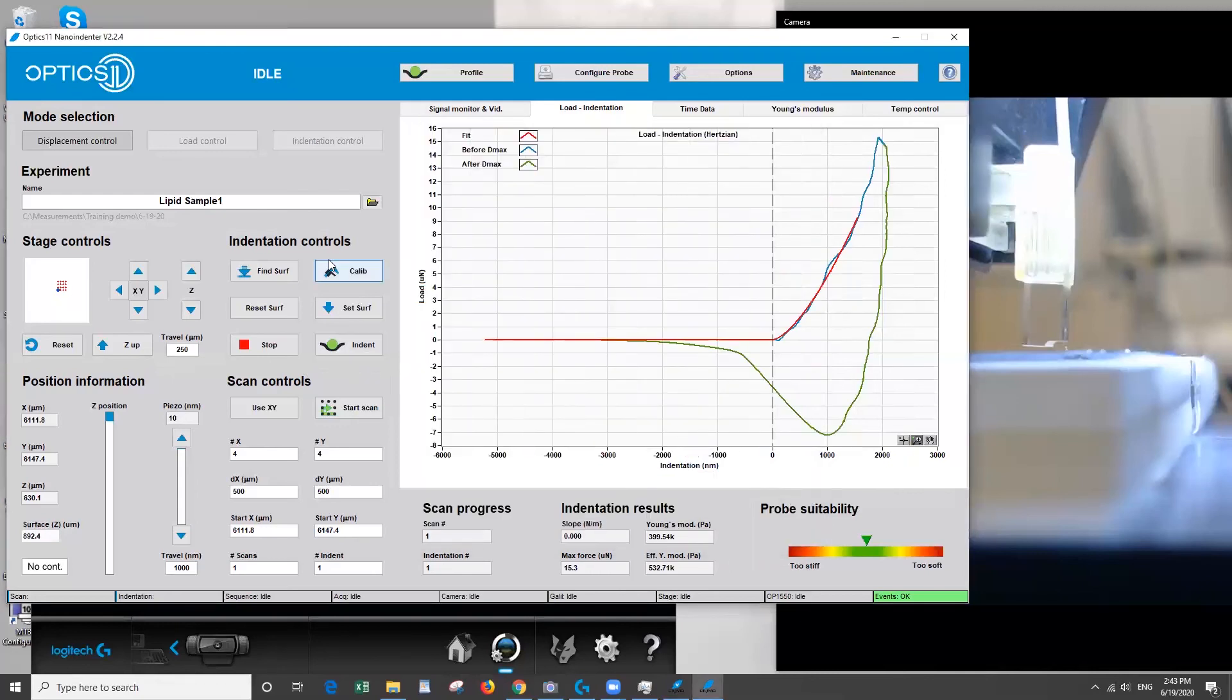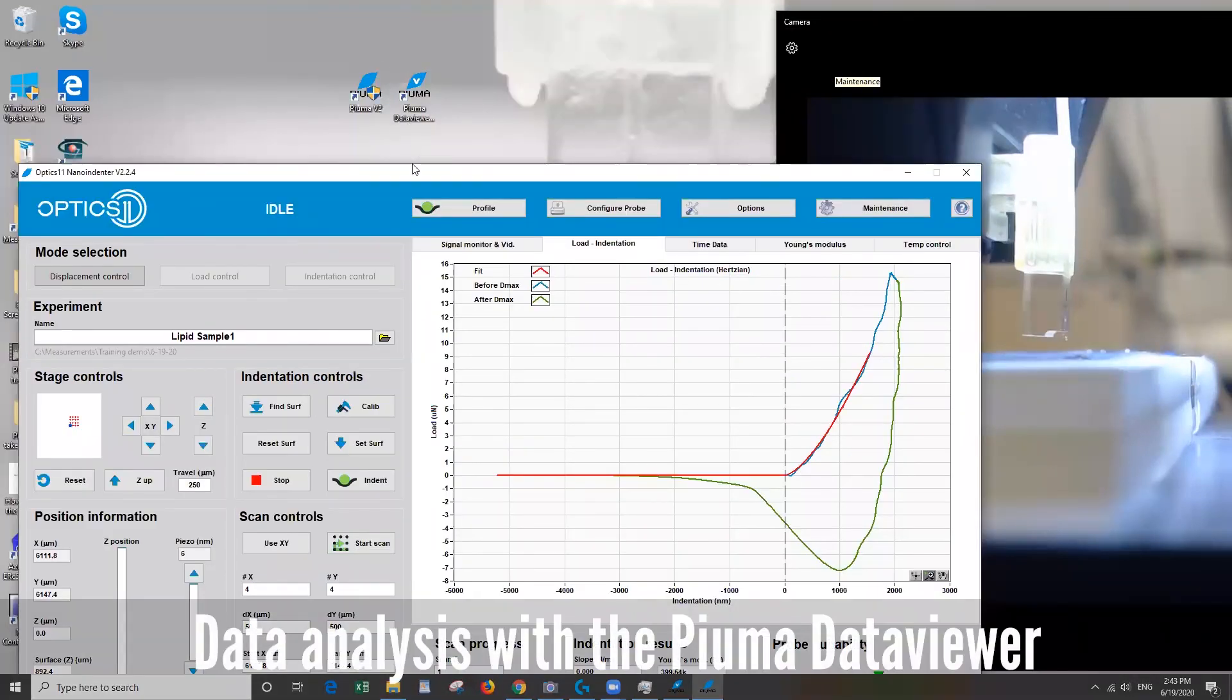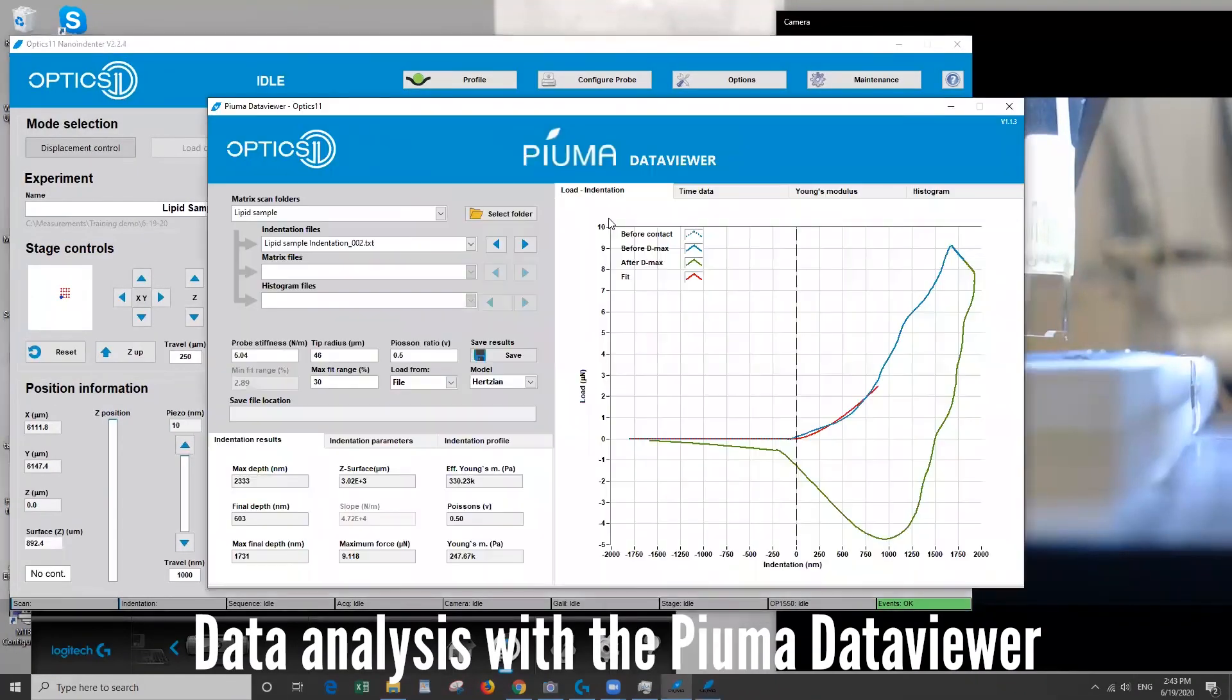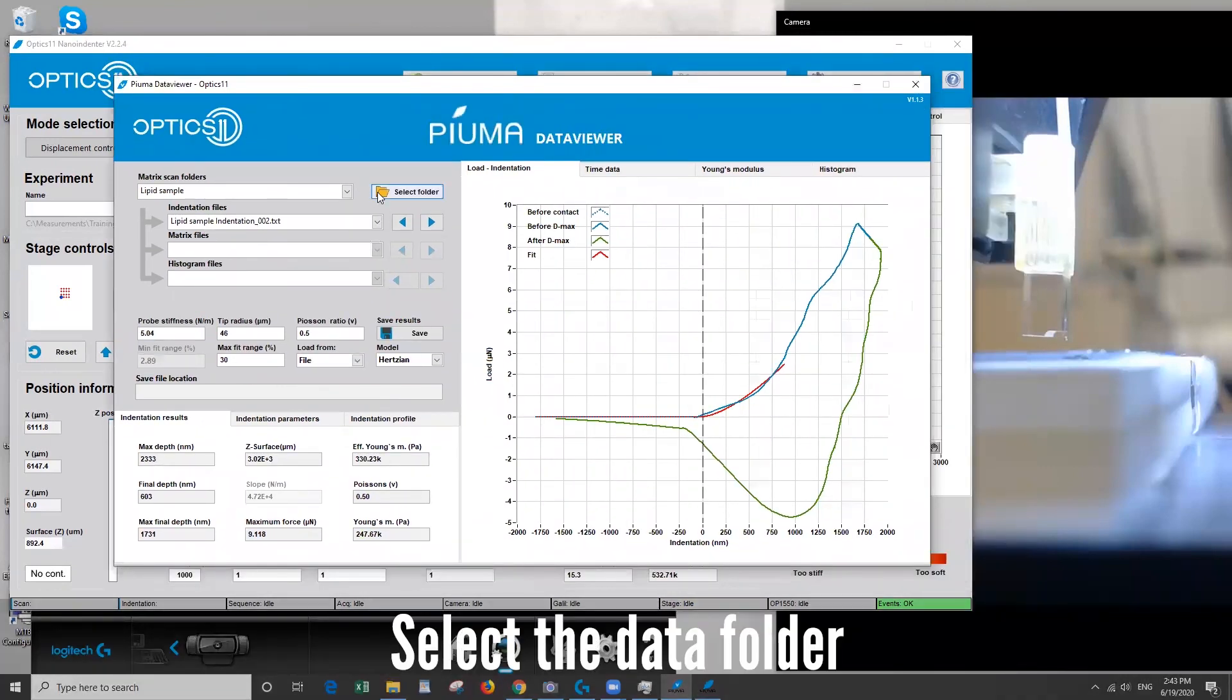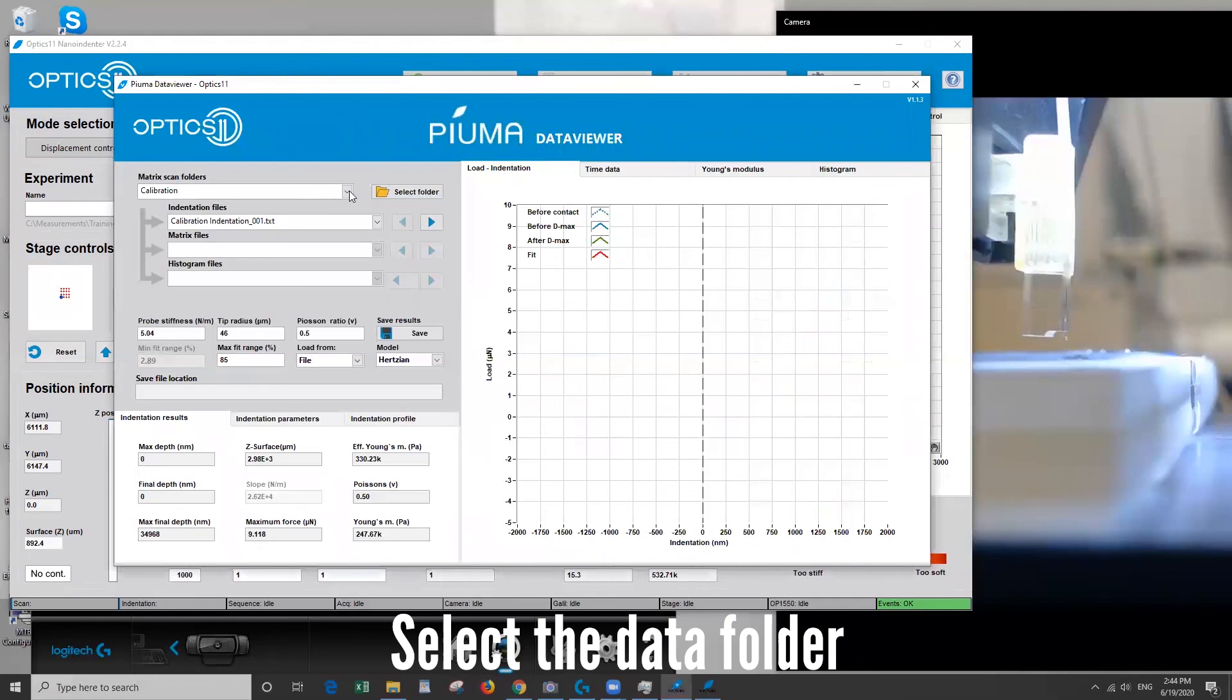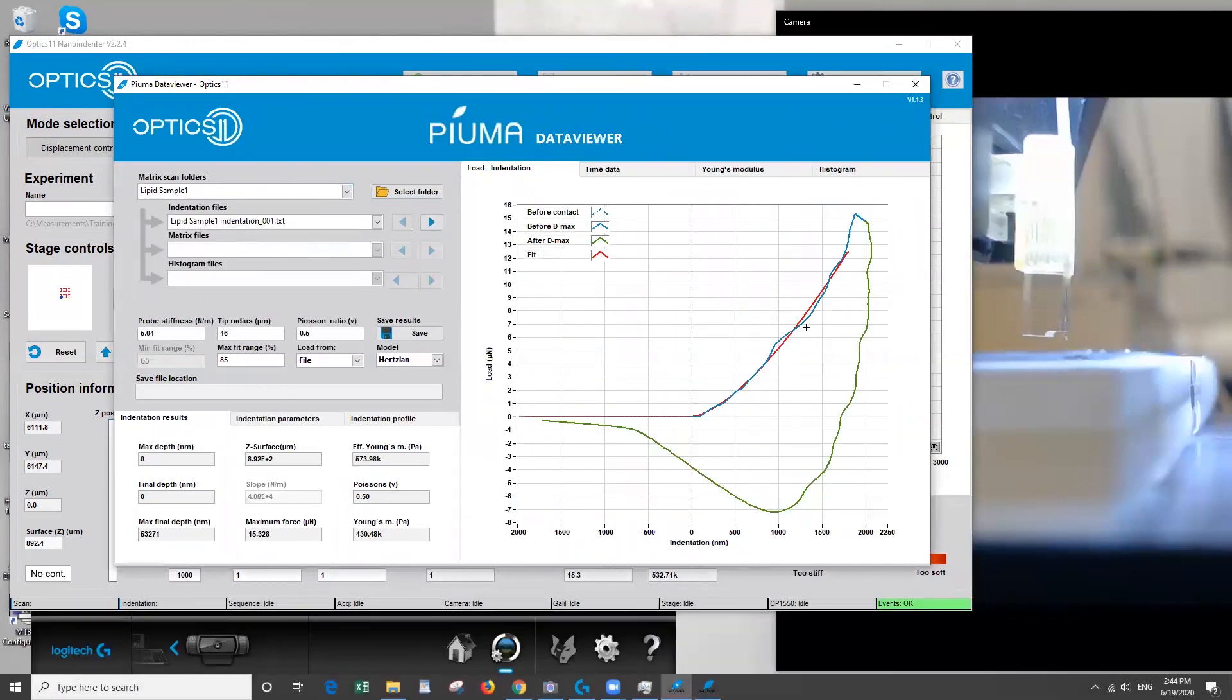Okay, so after you are finished with all of the indents that you are interested in performing, you can raise the tip up. And then what we can do is open the Puma Data Viewer. And I'll show you how to do some basic data processing. So first you'll choose your folder. So we saved ours in this folder here. And then we can choose which one of these that we just took data on. You can see the curve here.